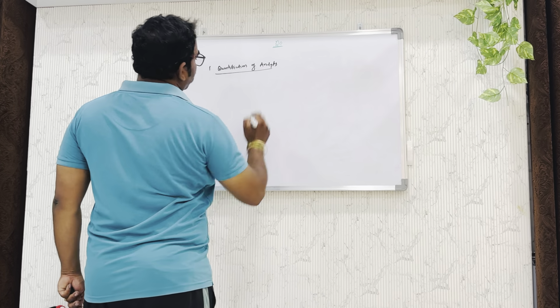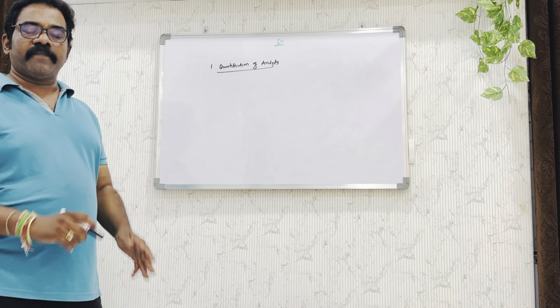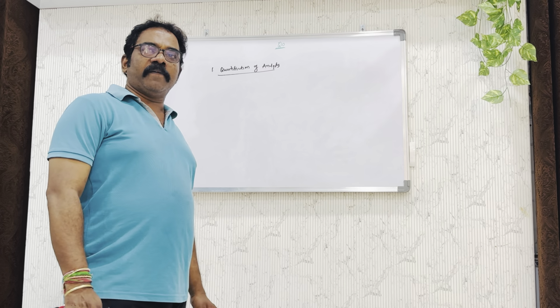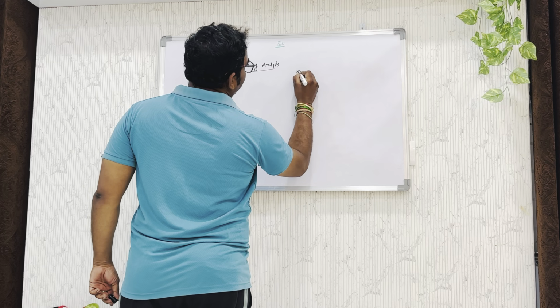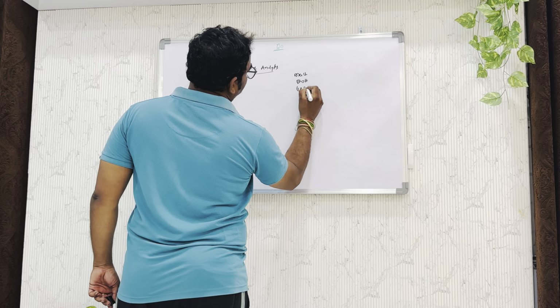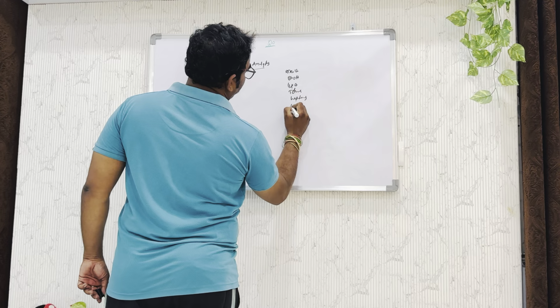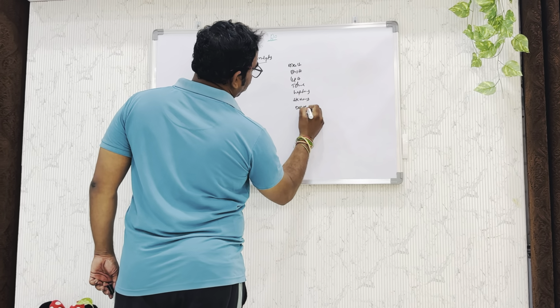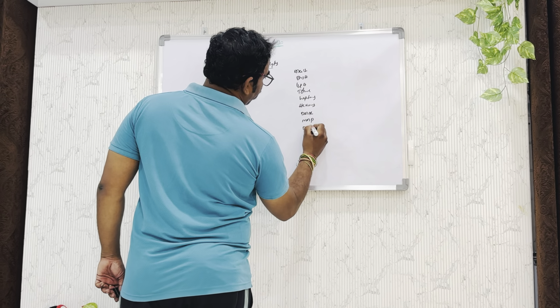analytes. During the manufacturing of drug substance, during the synthesis of drug substance, the CRD team might use some solvents like methanol, ethanol, IPA, toluene, heptanes, hexanes, DMAC, NMP, DMF.